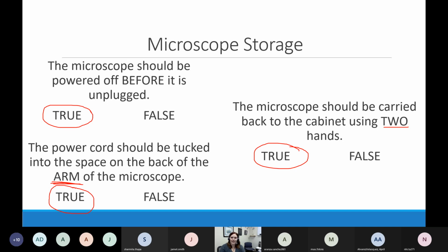All right, well, let's chat the last topic I'm going to do with you, and then we'll go into group work. I got a last minute question from Jamel. Good question. What would I use the 100 times objective for? For us playing around with the virtual microscope, if you're playing with the virtual one, you'll see that it talks about a 100 times objective lens.